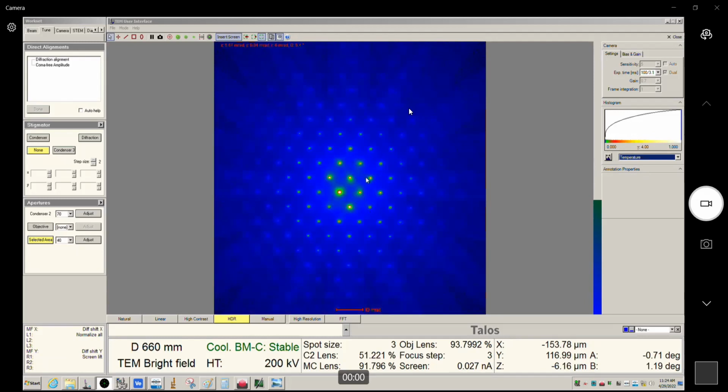Okay, and actually, I'm going to fudge with the stage tilt slightly just to drive the point home. You can see right here, I clearly don't have good zone axis alignment. Now you could very meticulously fudge with your stage tilts to try and get that spot to zone axis alignment. But if you just want a zone axis pattern for the purposes of acquiring the diffraction pattern, we can do a trick by adjusting the beam tilt just to get a good zone axis alignment for purposes of acquiring the pattern.